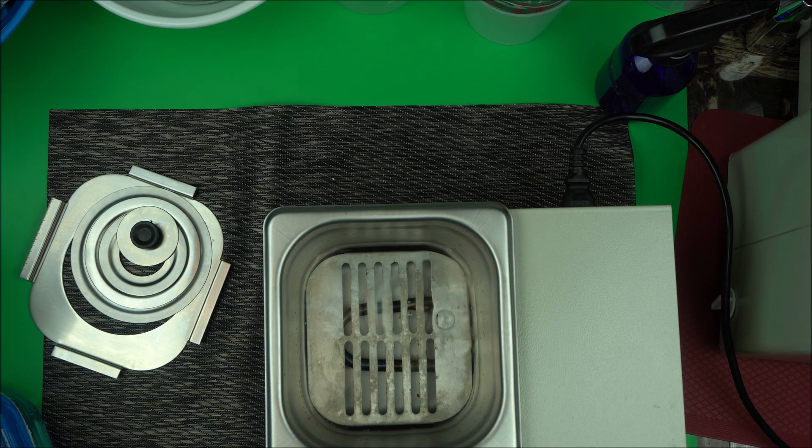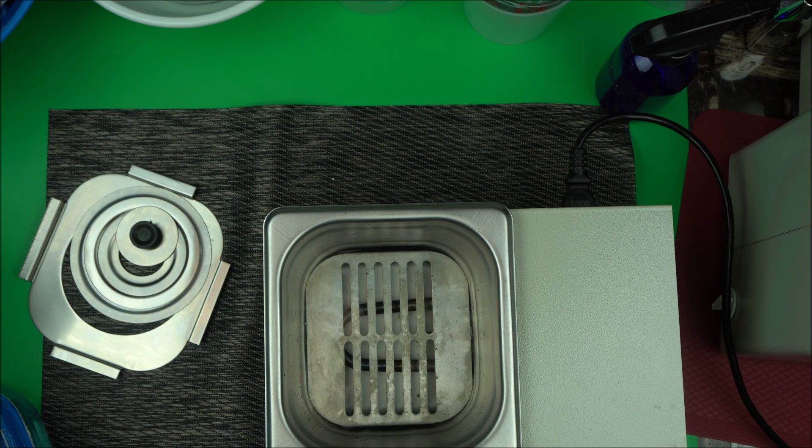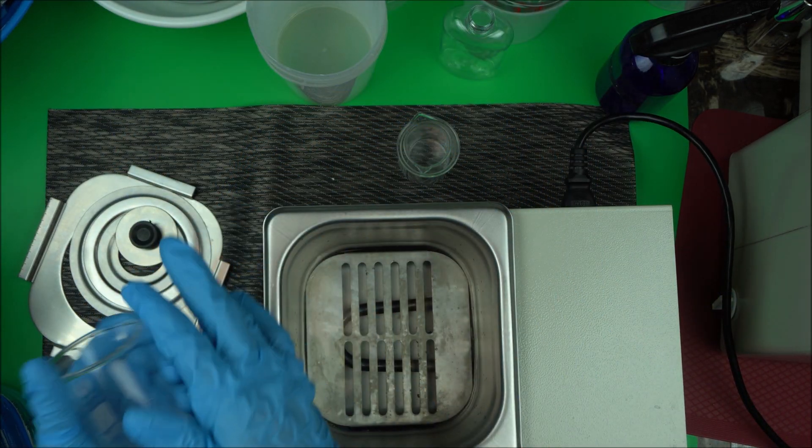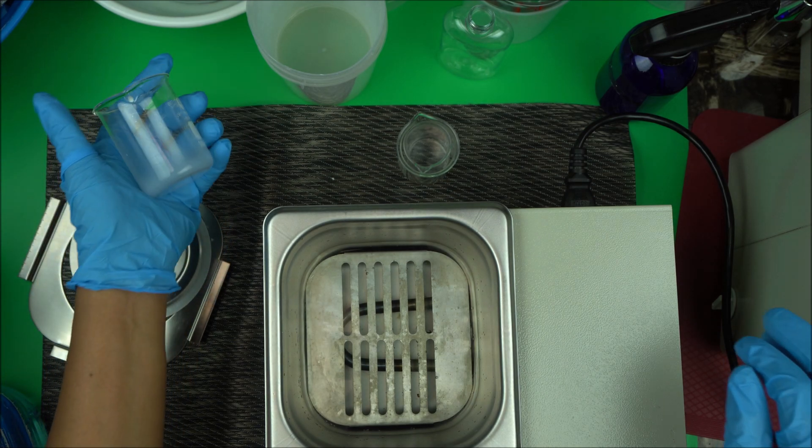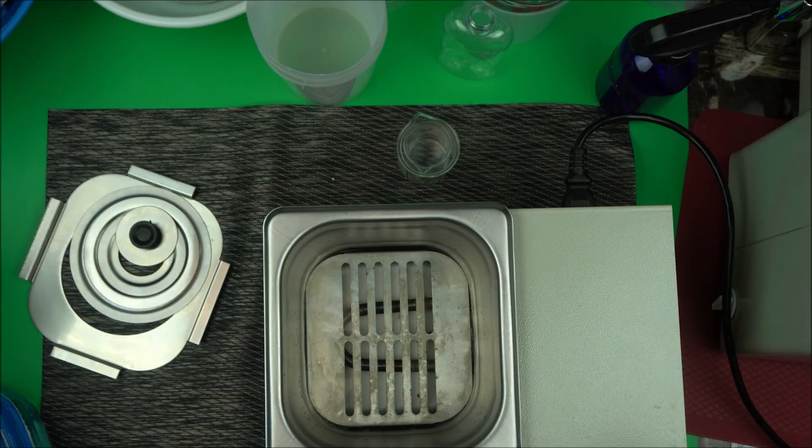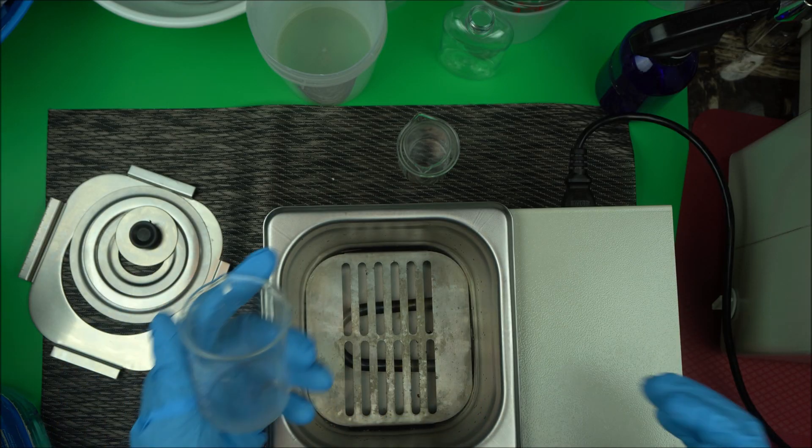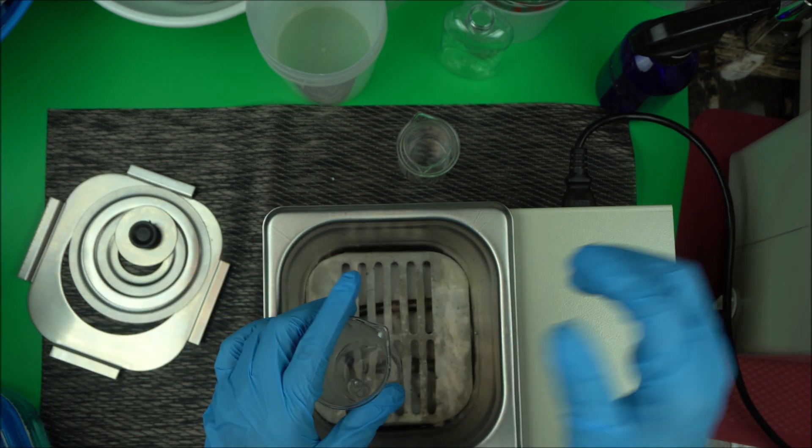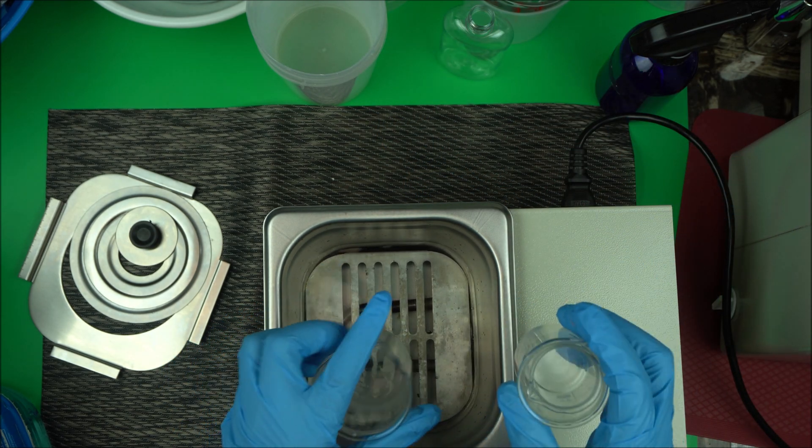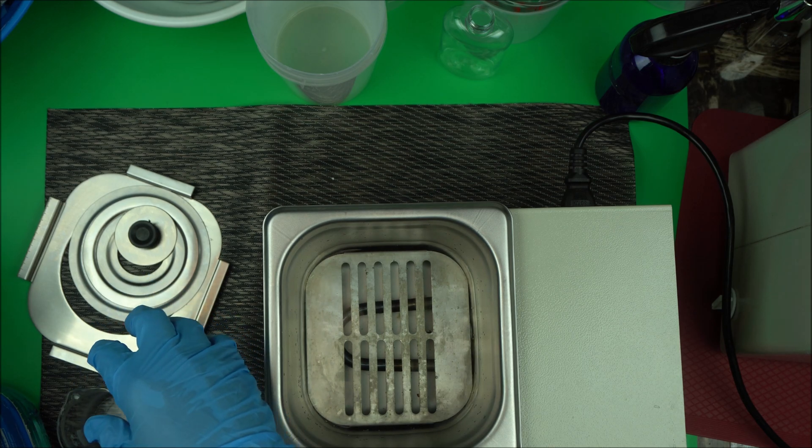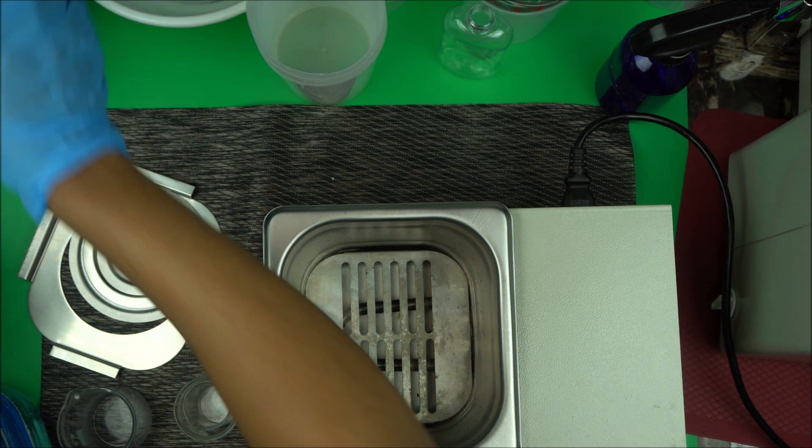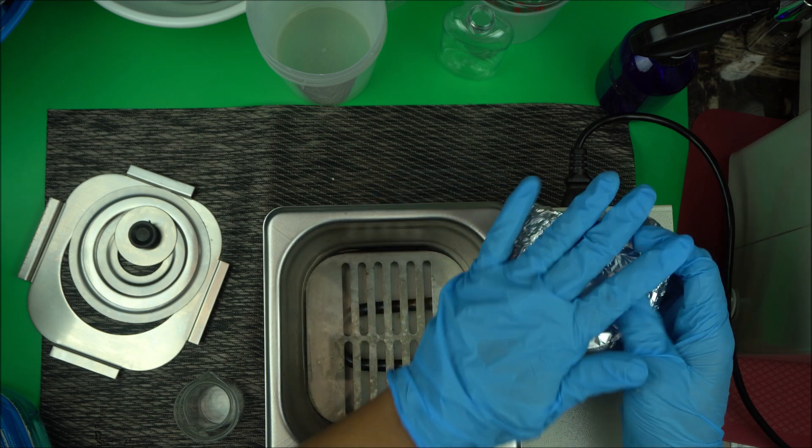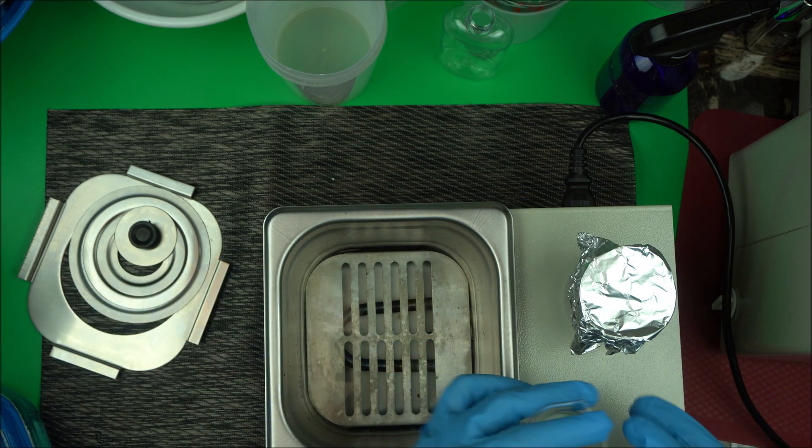Remember we have the oil phase and the water phase when you are making lotion. You put in your water phase ingredients in one beaker, then in another beaker you put in your oil phase ingredients. Use foil to cover both beakers.